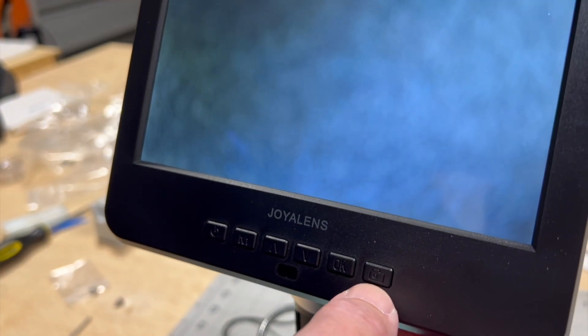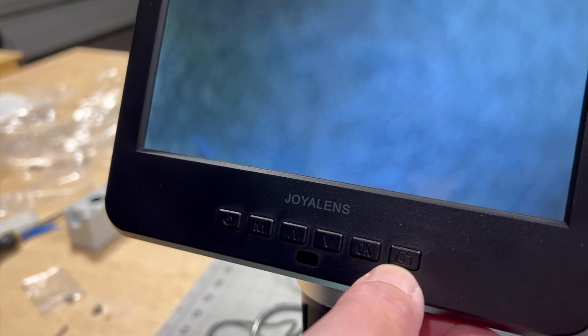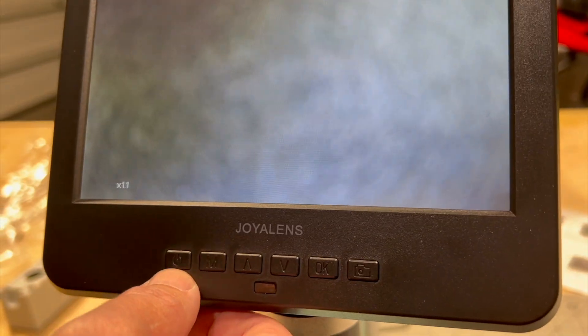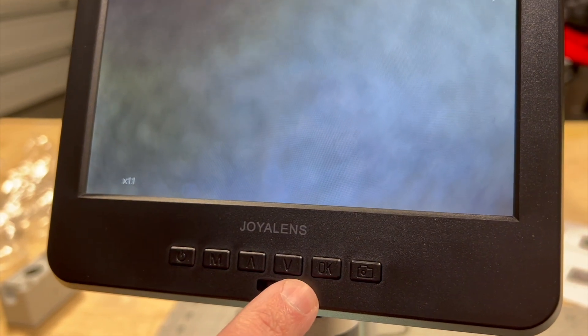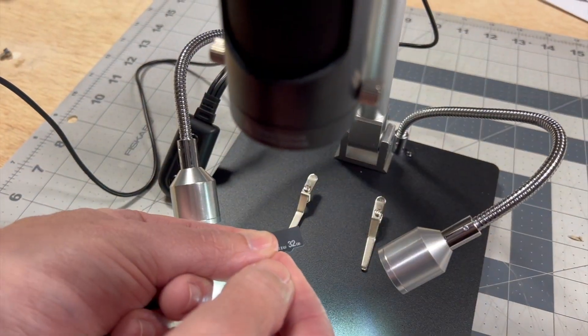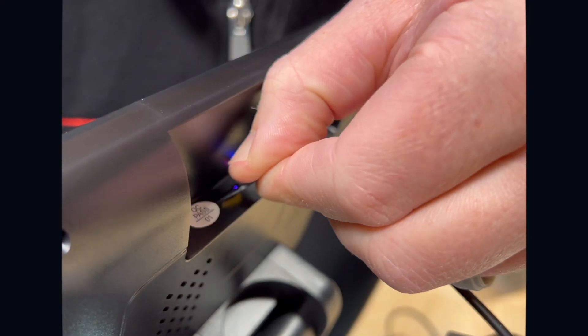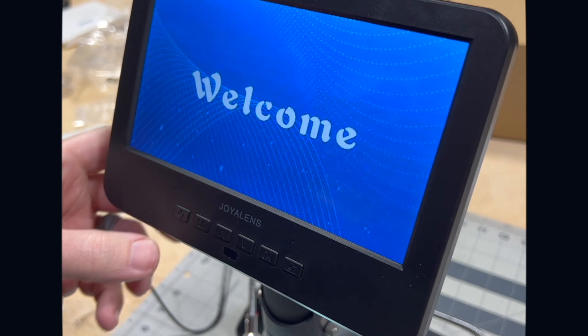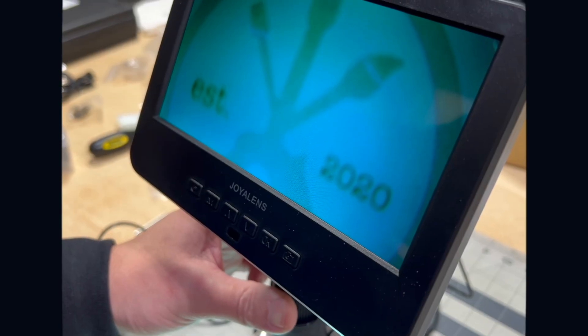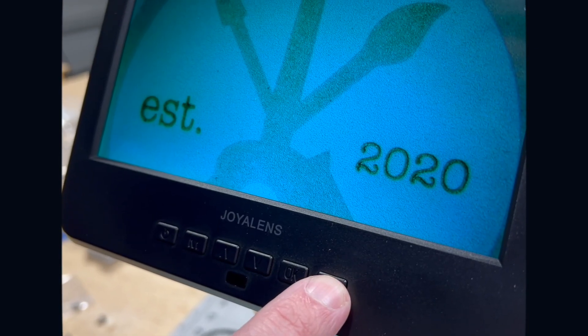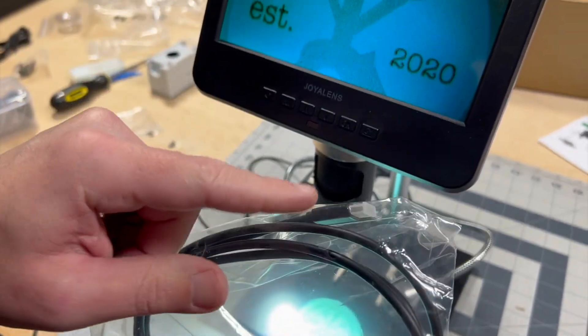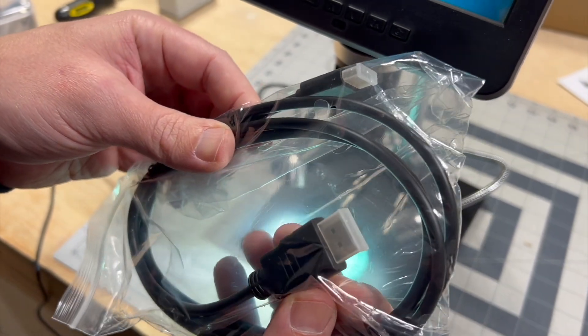This little DC plug is what we had plugged into this light box if we were going to be using lens D to look at slides, but we're not going to look at slides right now. So this will actually plug into here so that these spotlights work, and then this cable plugs in here. This one is our power source, and then we got some light controls here, brighten and dim. Okay, so we can take a picture by pressing this button here. Looks like some selections that we can do in the menu and the power button. So let's put in the SD card. Here's our mini SD 32 gigabytes.